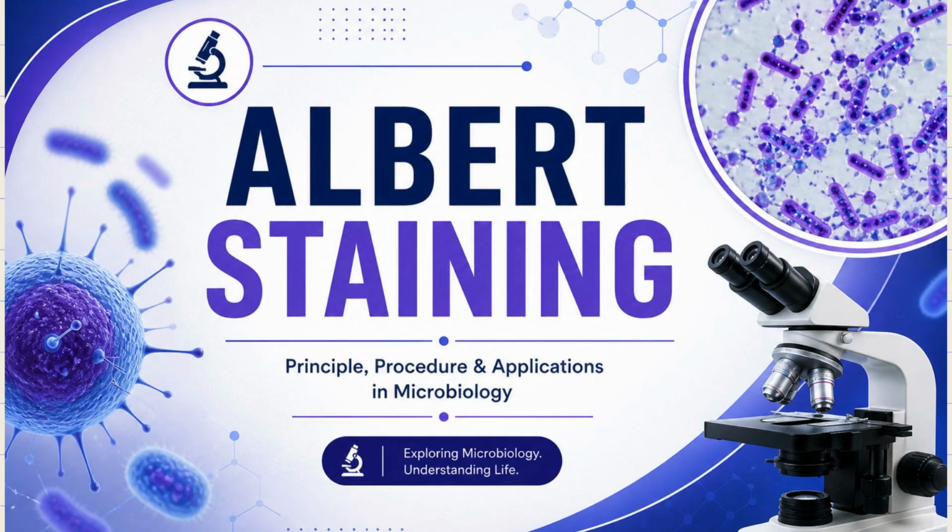Today we are going to study an important and classic microbiology technique, Albert staining. This method is mainly used to detect metachromatic granules, also known as volutin granules, in bacteria. In this presentation, we will cover the principle, procedure, results, and clinical importance of Albert staining.